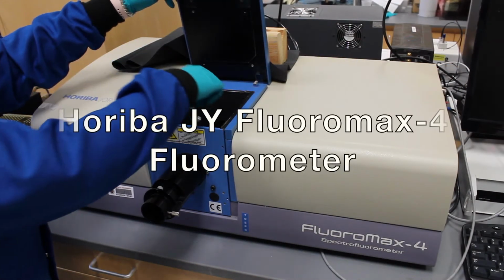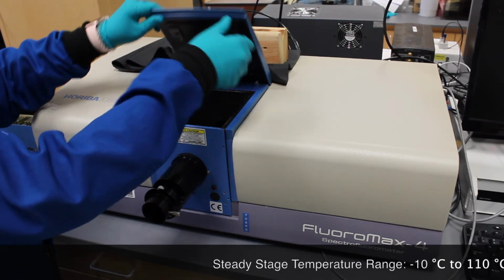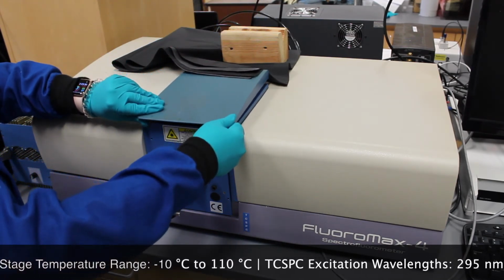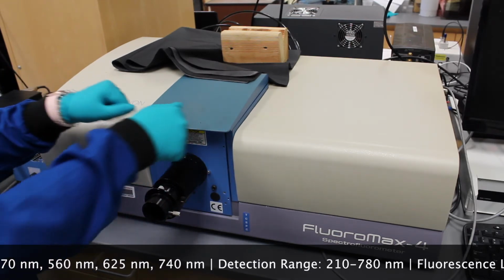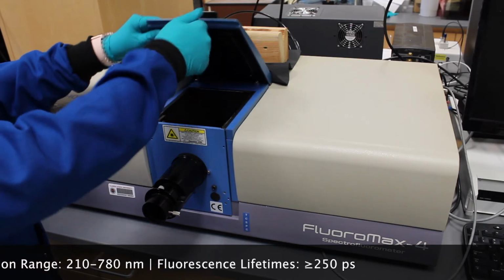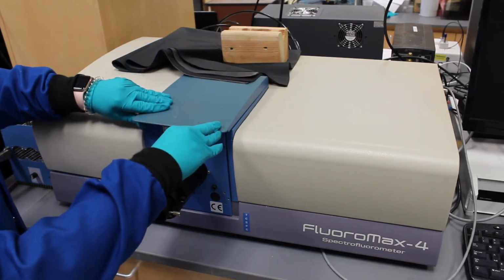The Fluoromax fluorimeter can perform steady-state fluorescence spectral analysis with temperature control and time-correlated single-photon counting fluorescence lifetimes. LEDs with various excitation wavelengths are available for lifetime measurements. The instrument can measure liquid, solid, and thin film samples.